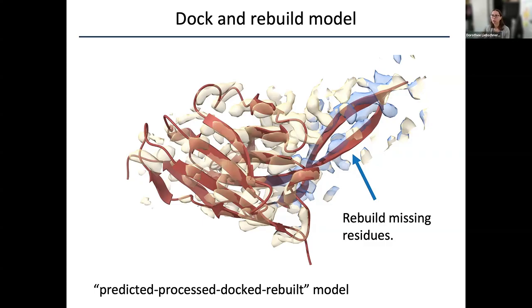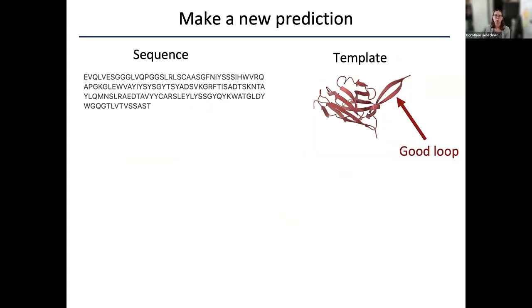But we can actually circle back to AlphaFold prediction. This time we will do a prediction where we will supply this sequence, but in addition, we will also supply a so-called template. So we can supply an example, a hypothesis, for this prediction into the AlphaFold program.